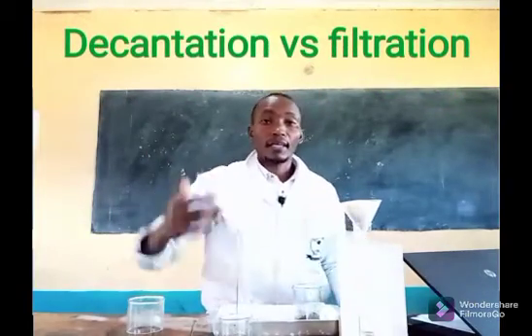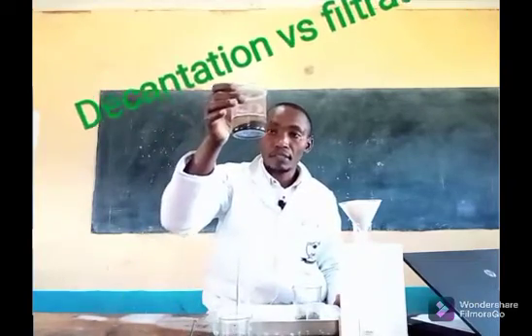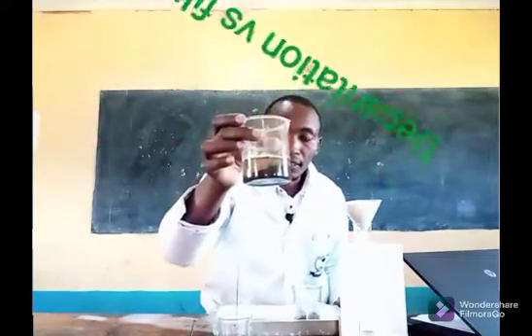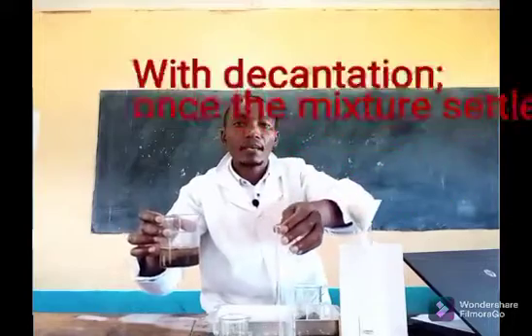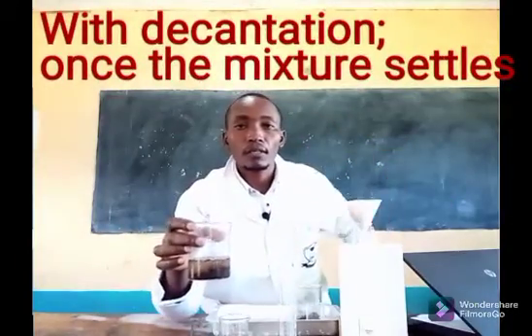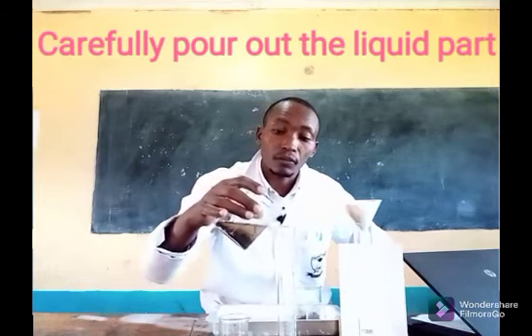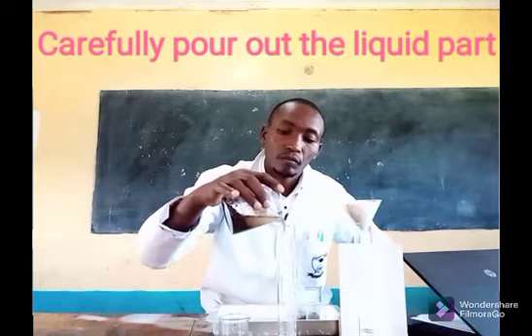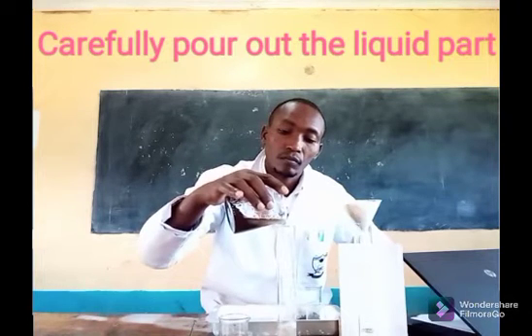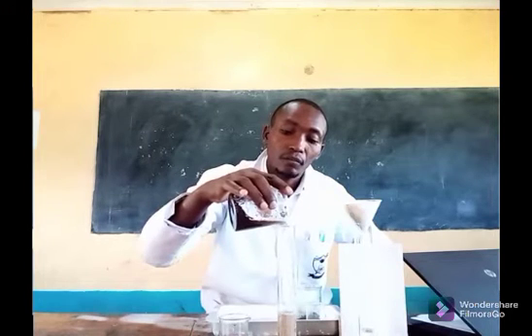Then I can go ahead and try decantation. I have my mixture here. I can see the solid particles have settled at the bottom. I carefully decant. That is, I carefully pour out the liquid part, then I remain with the solid part. Carefully I do decantation.